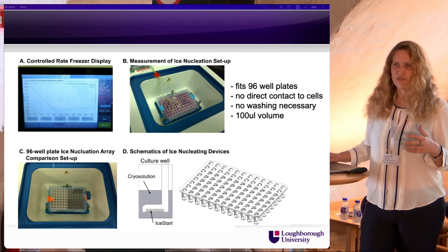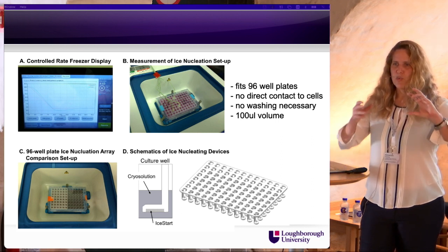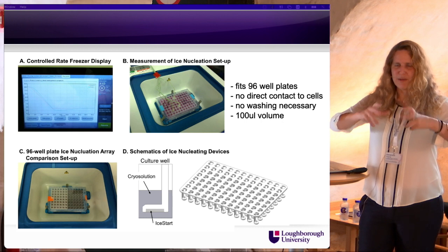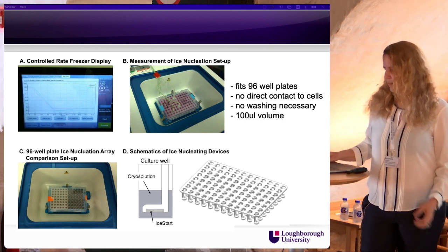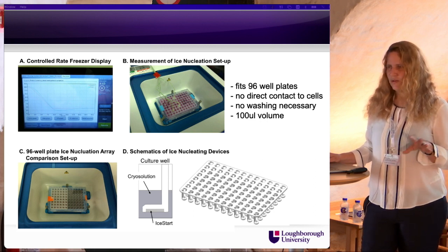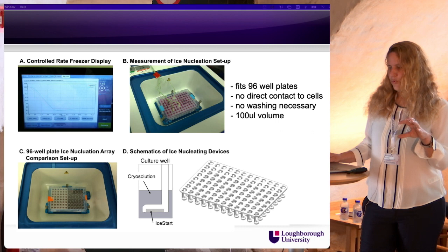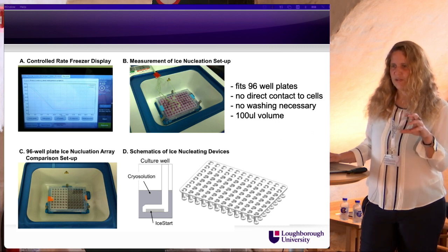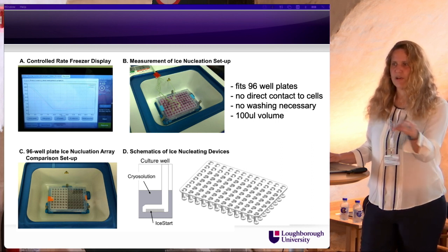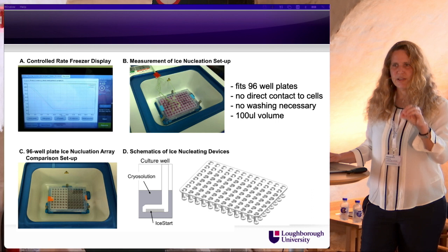But as I said, the plastic of the 96-well plates is not made to withstand such low temperatures, and they warp. I unfortunately never took a photo of it, but they really get mechanically twisted. That means your samples are unsterile and the cells will be mechanically stressed, but we did our very best to deal with it. One other problem with such plates is that the moment ice forms in your cryopreservation solution is completely random. It can happen chaotically in your plate, and that's not useful because you want to tightly control this process.